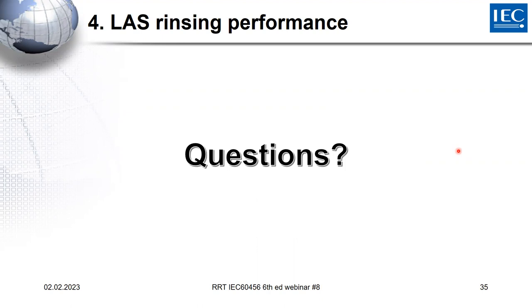But LAS, we could measure. Yes. LAS, you can measure in any detergent that contains LAS. This is currently almost all detergent. It might change in the future, but currently you can measure it in almost all detergents. Okay. Thank you. And just one more question related to the alkalinity procedure.